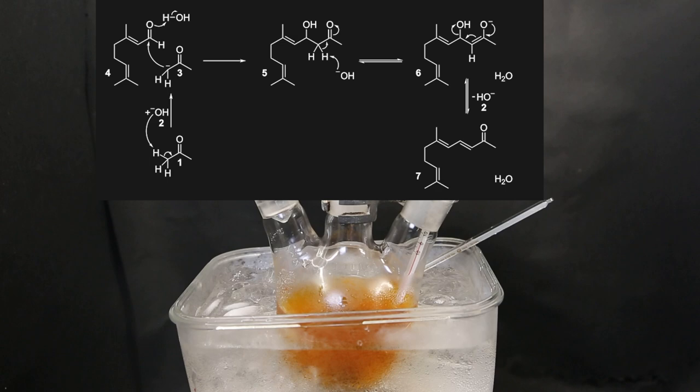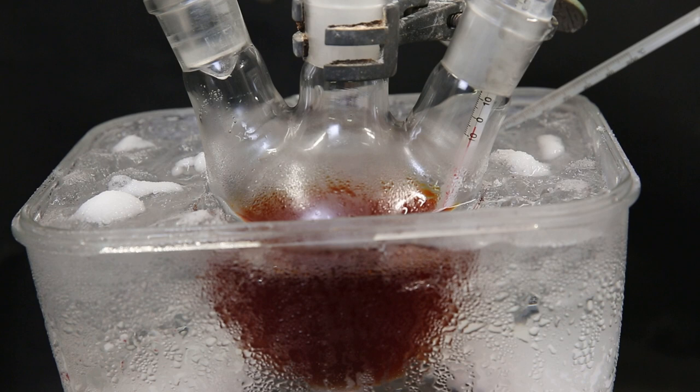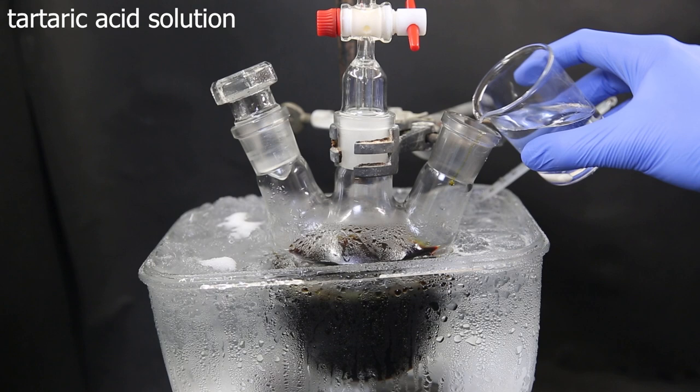When all of the sodium ethoxide solution had been added, I left it to stir for a few more minutes. And after that, I added the previously prepared tartaric acid solution to the mixture. This will destroy any remaining base. And immediately a white precipitate forms and the solution quickly turns orange.